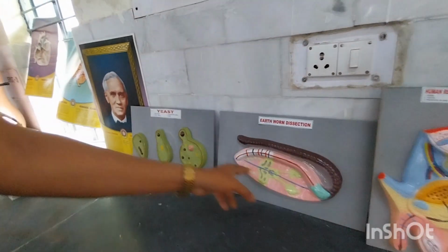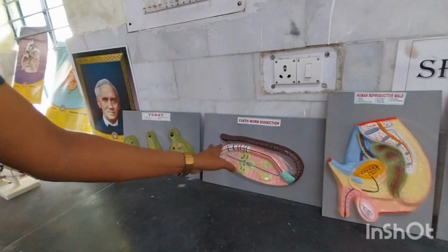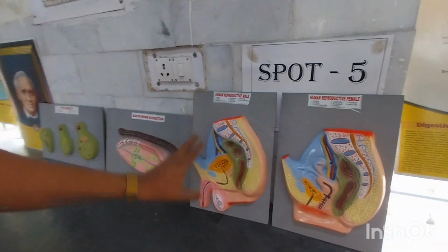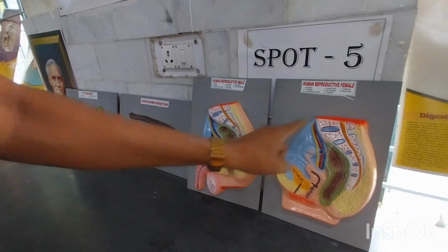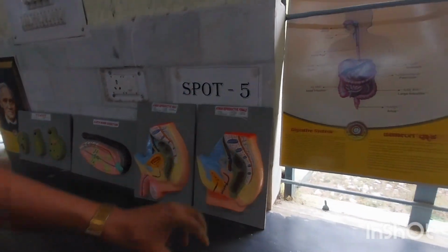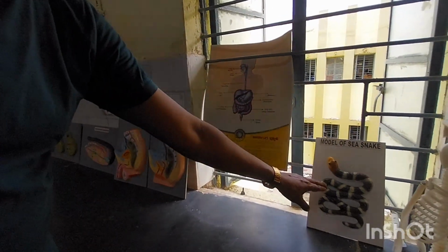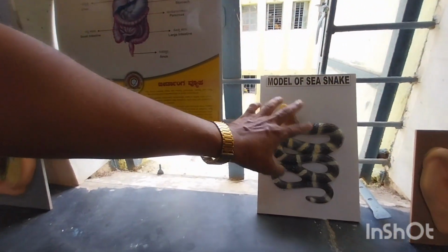This is the dissection of the earthworm, internal structure or body parts of the earthworm. Here the reproductive system, this is the male reproductive system, different parts, and this is the female reproductive system and different parts. Here we can see the digestive system chart. Here this is the sea snake, model of sea snake.